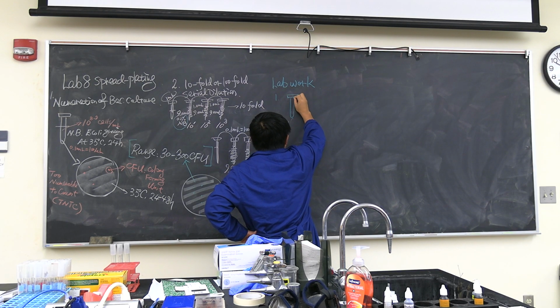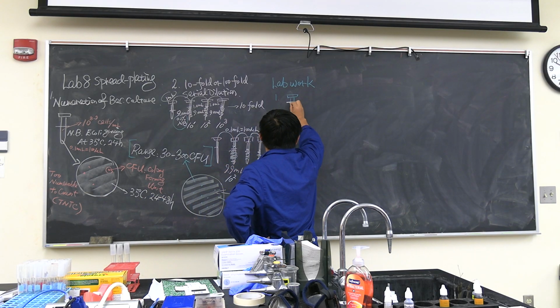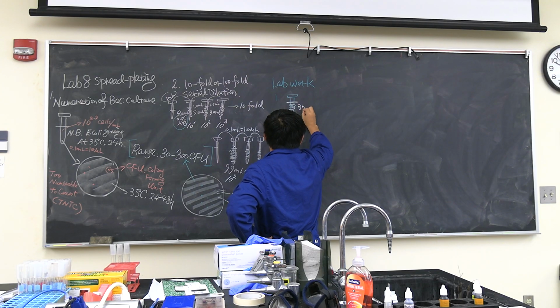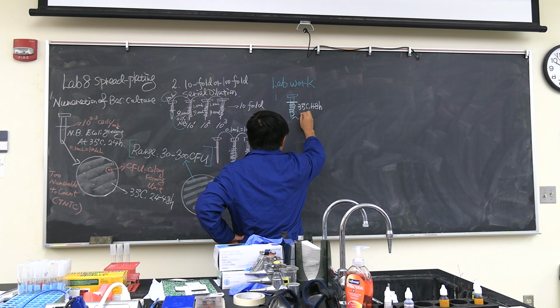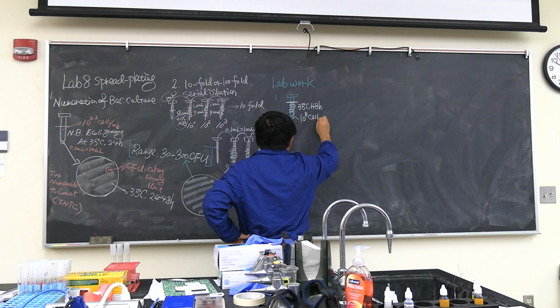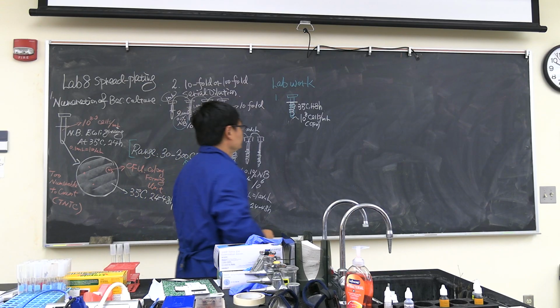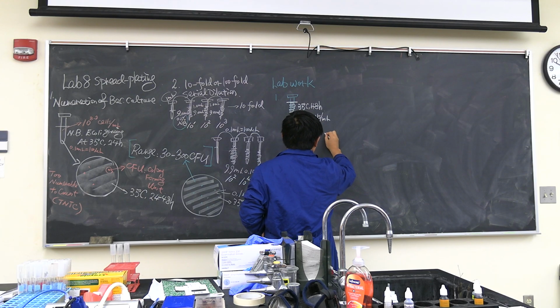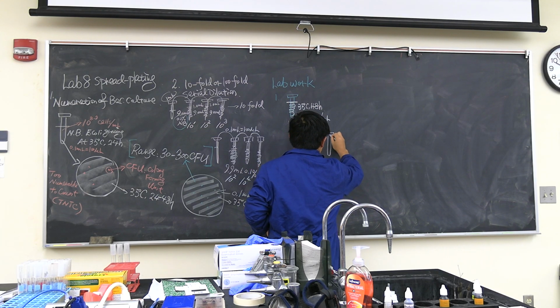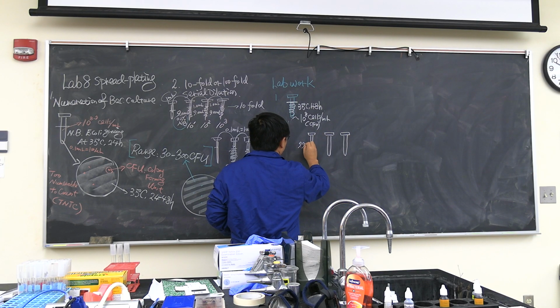We had a broth. This broth has been grown at 35 degrees Celsius for 48 hours. So I guess it is approximately 10 to the 8 cells per ml, the same as CFU per ml. So I'm going to do a dilution factor. How are we going to do it? Since it is a lot, I'm going to make the life easy. I'll prepare 3 9.9 ml dilution tubes. So every one of these is 9.9 ml.